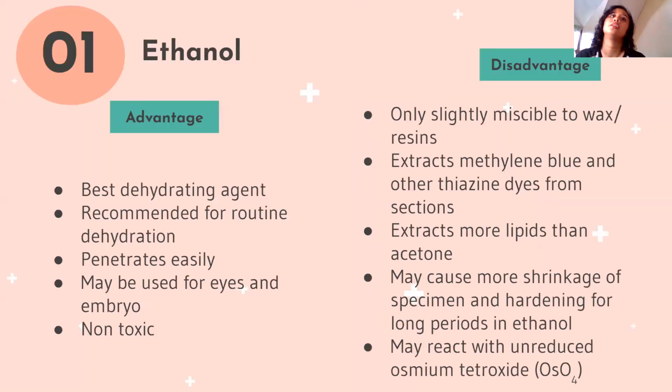Thick. Okay, so we will tackle today 11 dehydrating agents, guys. I got this in Gregorius, and I tried searching other references kung what would they say about the topic. I-screenshot nyo na lang, guys, itong mga slides na to because yung iba paulit-ulit lang. Okay? So, I'll just emphasize a few things.